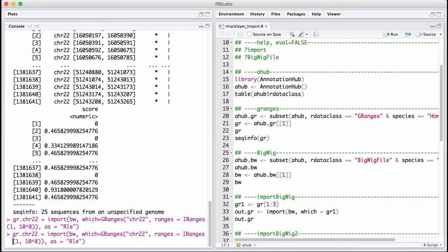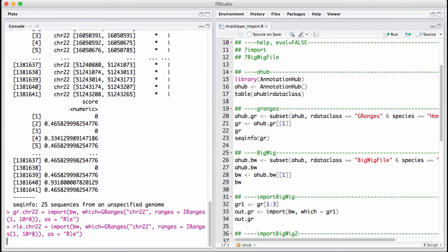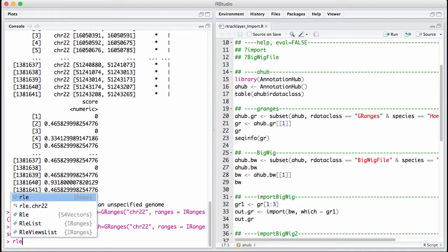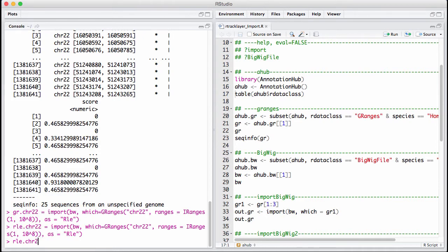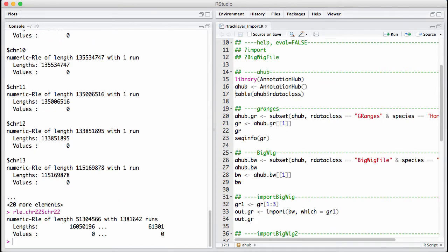So I get back an RLE list because I get back one vector for each chromosome. We only read in chromosome 22, so the only thing that really matters is chromosome 22, which gives us this nice run-length encoded vector.